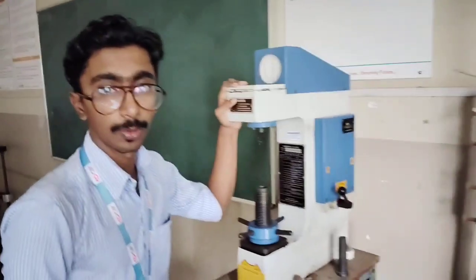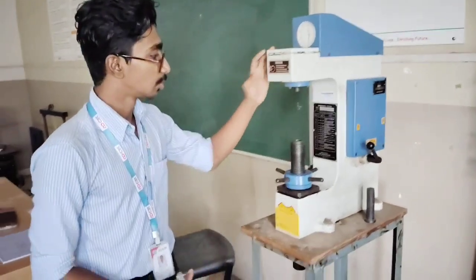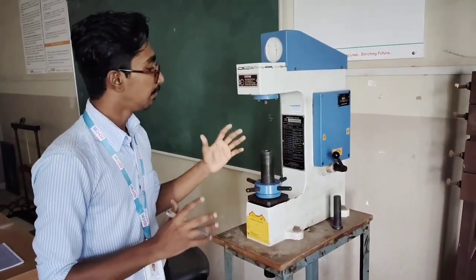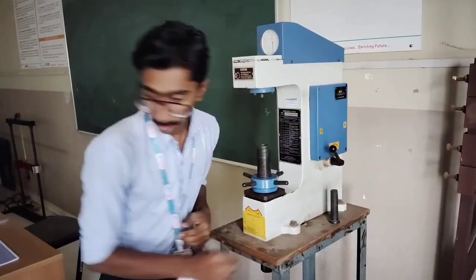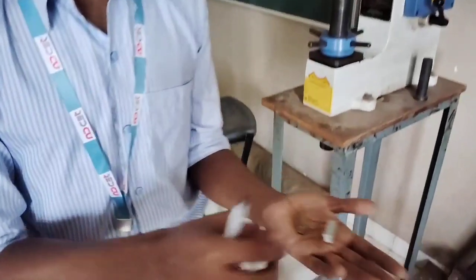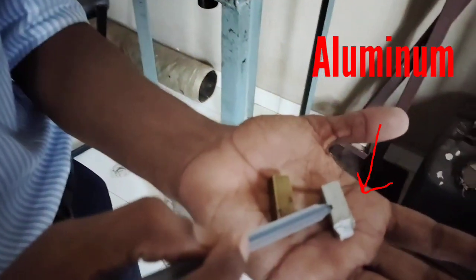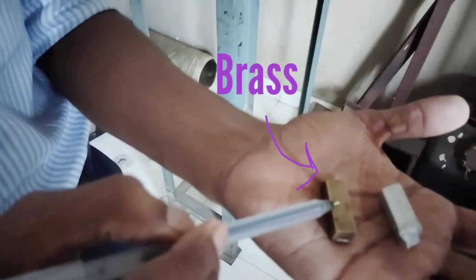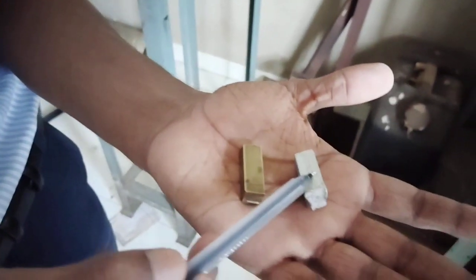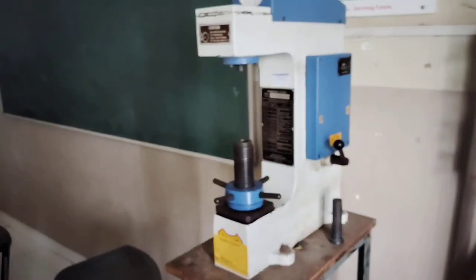I will now walk you through the equipment. This is a Rockwell hardness testing machine. In this machine, we can test various specimens, and out of them I have two specimens. This one is aluminium and this one is brass. Today we are going to test aluminium as well as brass using the Rockwell hardness machine.